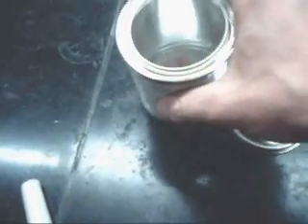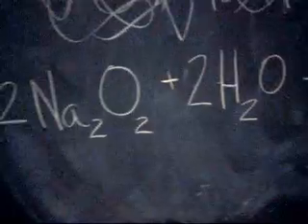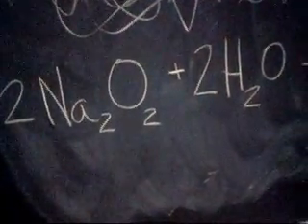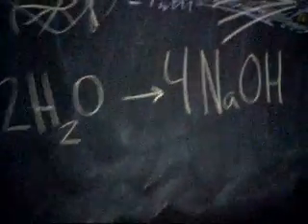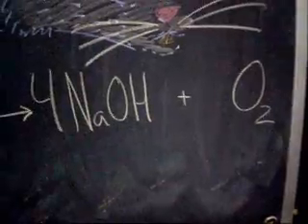It comes in this nice solid pellet form, yellow in color. Two moles of sodium peroxide will equally react with two moles of water. When this happens, you're going to produce sodium hydroxide, so you'll have a very caustic solution when you're done, so safety should be taken into account for that, and plenty of oxygen gas as well.